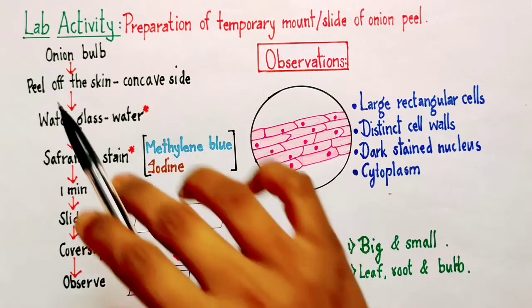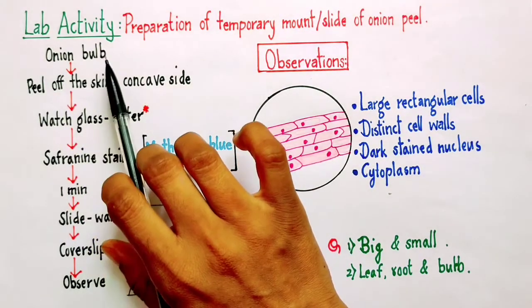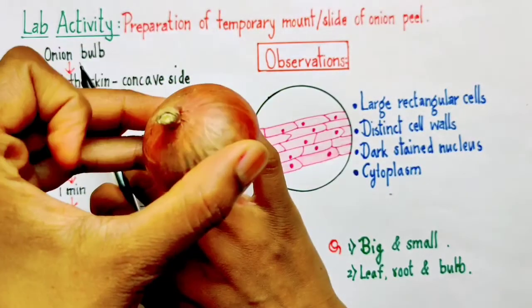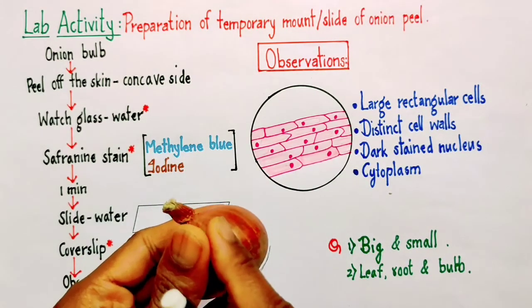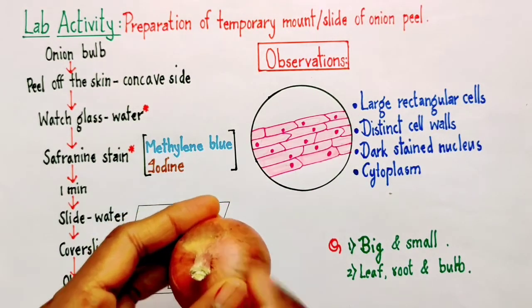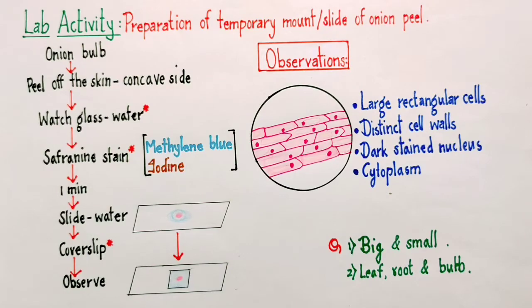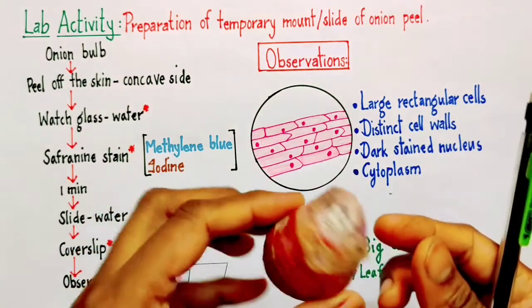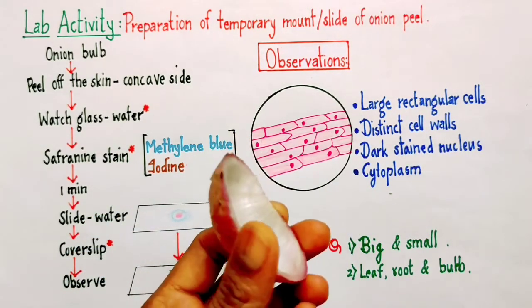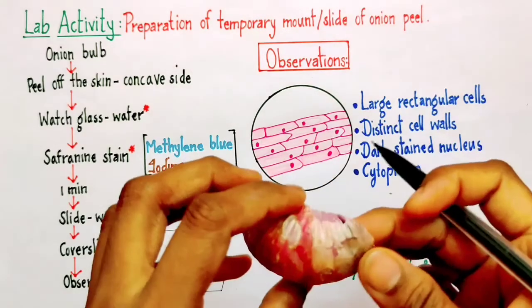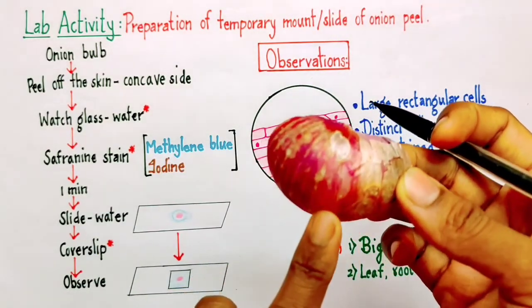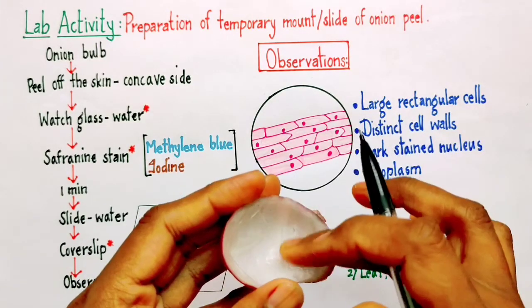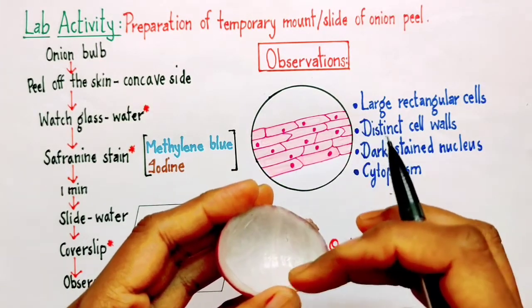The first step is we need an onion bulb. We have to cut the onion and once we cut this onion, we are going to get many pieces. Here I have one piece with me. You can see this is the convex side of the onion and this is the concave side of the onion.